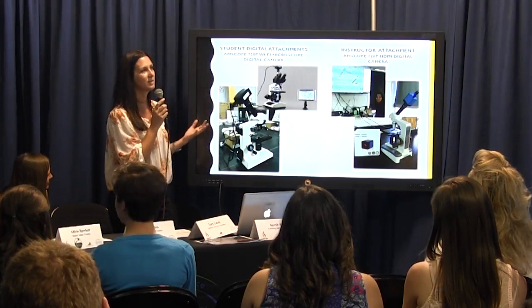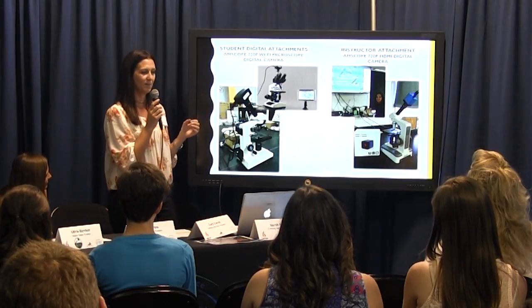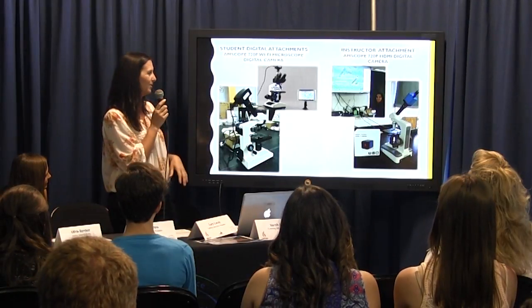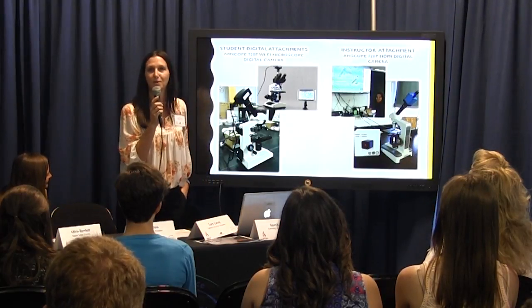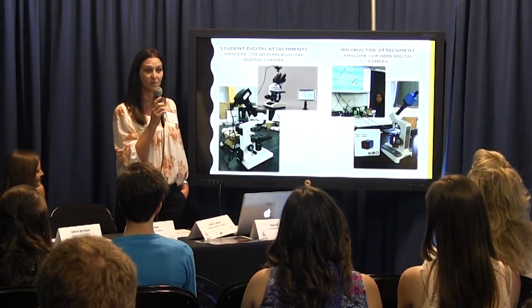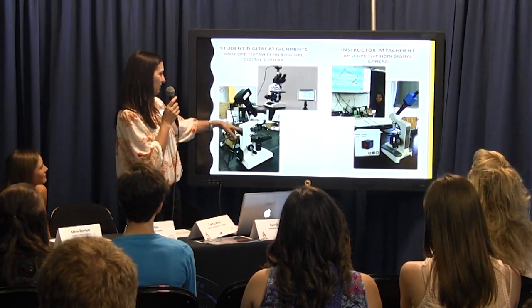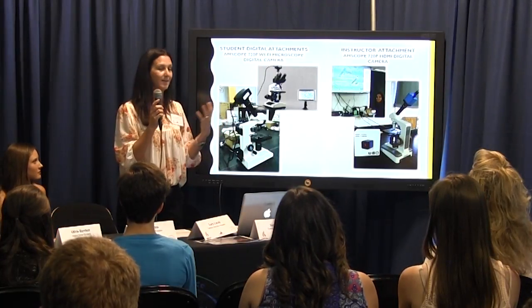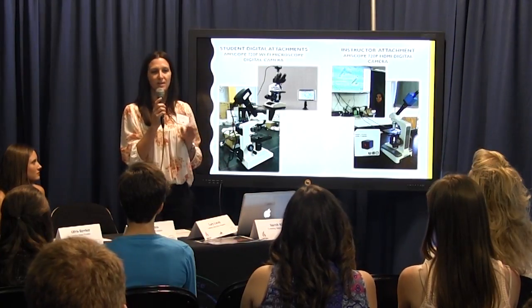When they're using a microscope, a lot of times you'll say, okay, look for this, and you can show them a picture of it, but half the time they're looking at dust or an air droplet or a water bubble, and then all of a sudden, when you're checking their work, they're looking at the wrong thing. Being able to use the microscope correctly is one thing, because they've torn stuff up in the past. They haven't used the lenses correctly, or they just move the objective lenses around. If they don't click into place, they're seeing black. They don't know, so that's one obstacle, using it correctly.